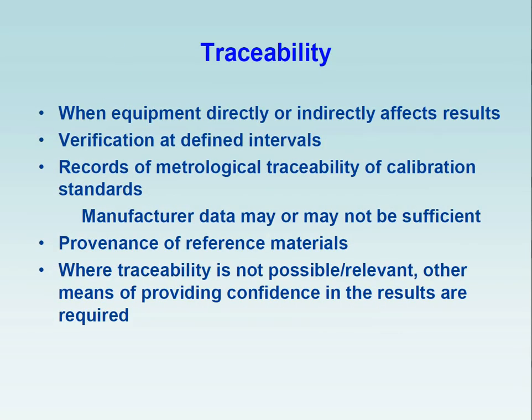Traceability. You need traceability for virtually everything that's coming into the lab, whether it be equipment, reagents. And you need to be able to verify at defined intervals. So you need to check each time it comes in that you do have full traceability for that. And it may be such that there is a recall on an antibody. You need to be able to identify exactly when that antibody, if you had that antibody, came into service, on what patients you used it on. That's quite extensive traceability.